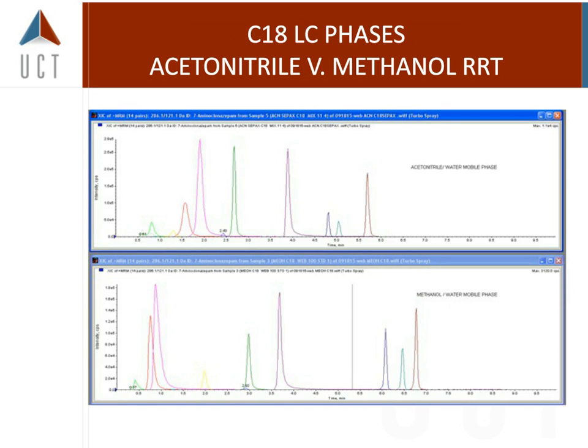And how I can see that, how I can view that, is by looking at how that compound chromatographs using the LC-MS and understanding why it comes out early. If it's polar and it's coming out at 20% organic, is my organic wash too strong in my phase? And you can lower that organic wash just like you're lowering your gradient, and it could stick onto your column.